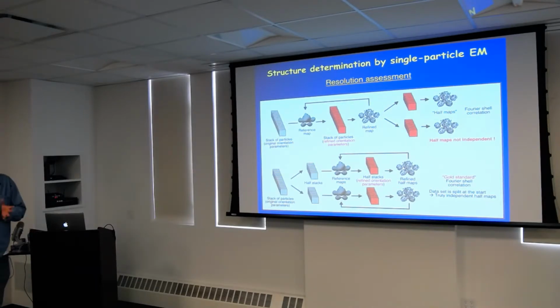So it's actually not totally true. The gold standard is really not that gold standard because it still has the same reference. It's still biased to some degree. But this is now the accepted standard in the field that you have to calculate this gold standard.